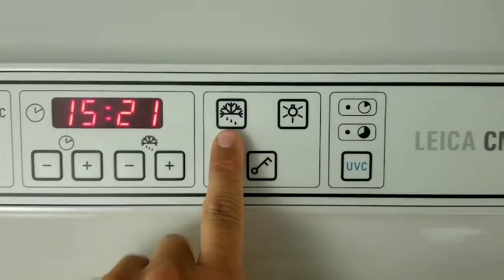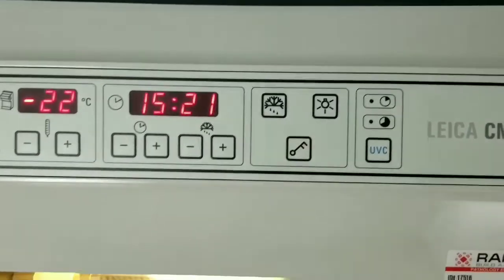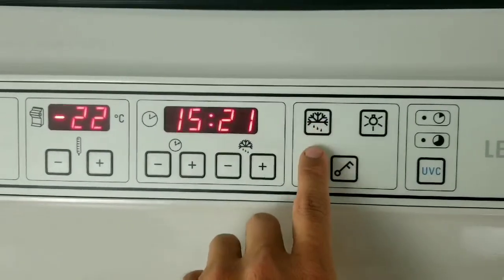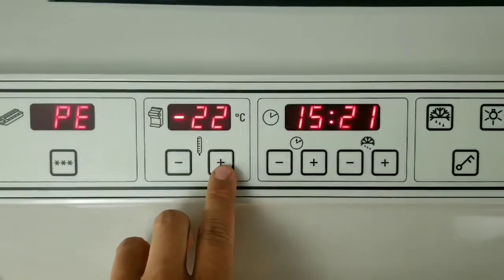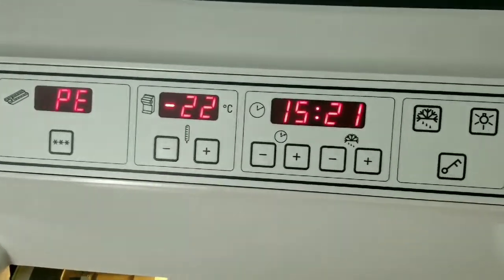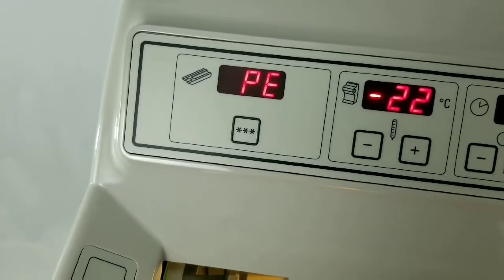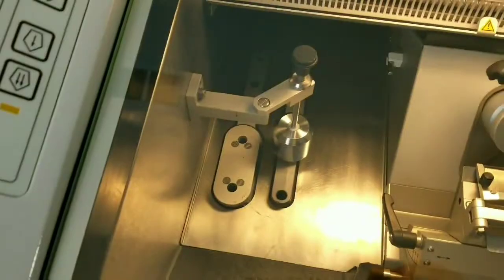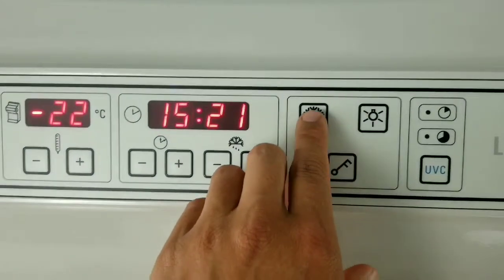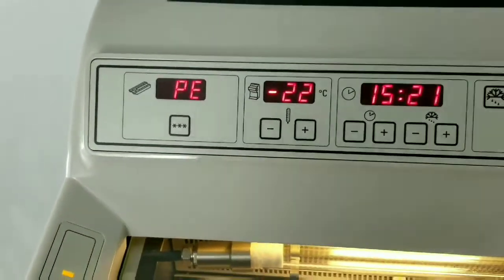This is your manual defrost button. To put the cryo chamber into defrost manually, press this button and then subsequently press the plus or the minus button on your set temp for the cryo chamber temperature. In order to manually defrost the quick freeze shelf, press this button again and subsequently press this button, and it will put that into defrost.